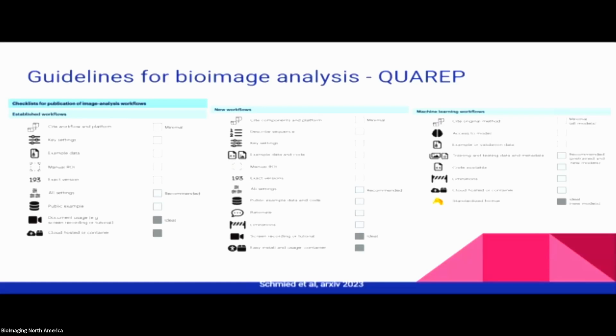But if people are coming to you and saying, I don't know how to even report the analysis that I did, we're hoping that this provides a guideline where you can say, you need to at least do this much. And we recommend, if you want people to follow the work that you did, to actually go to these further recommended and ideal steps.